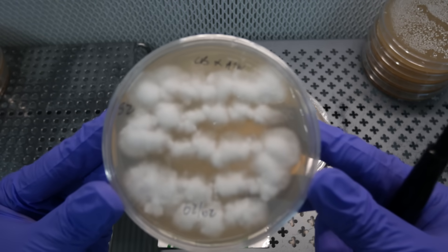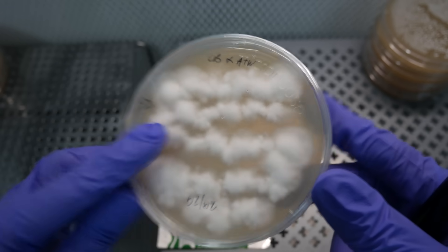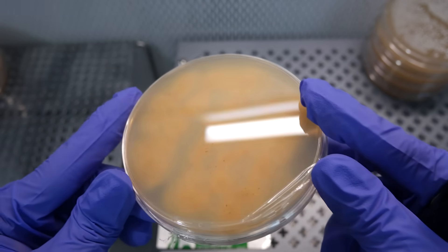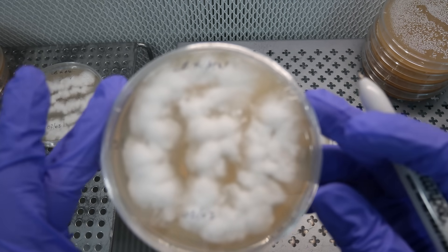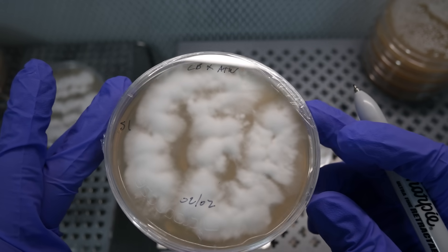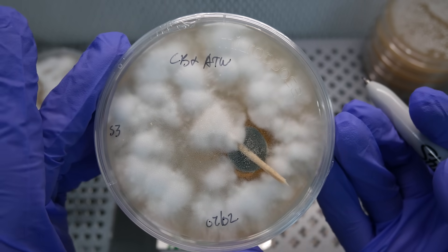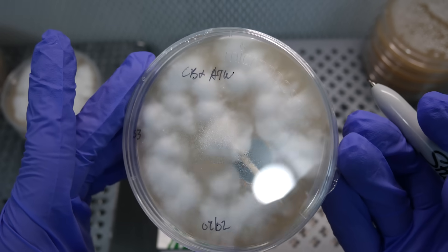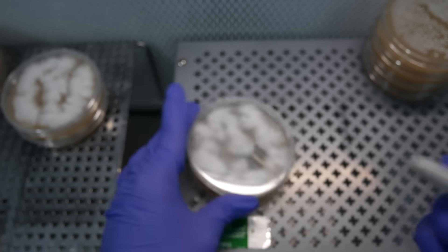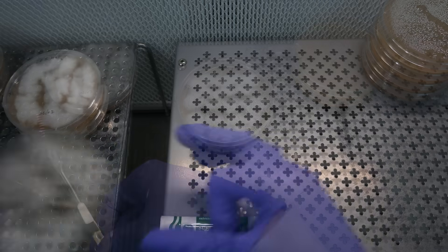After letting the plates sit out for another week — going on about two weeks now — this is what your plates can look like. The first one looks pretty clean; check the back side, pretty good growth. The second plate also looks pretty good. The third plate has contamination right where I jammed the swab into the agar, so that contamination must have come from my gloves. I'll throw that one away.